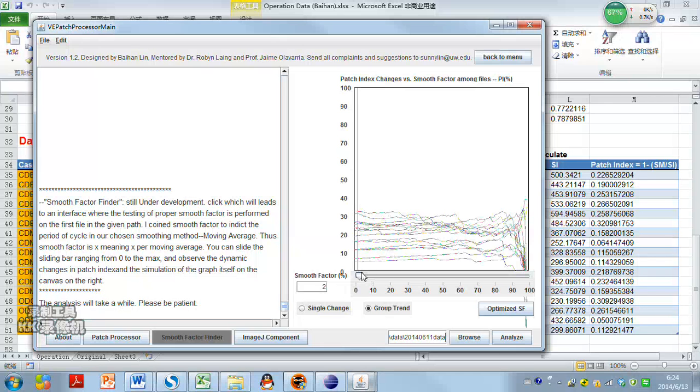So here, now it's generated. Okay, we can see it's pretty cool. For example, less than 10, no big difference. Maybe bigger than 50%, oh no, it's not workable anymore. But of course, you are not going to use something like that. But we can know that 0 to 5 seems to be a proper range.